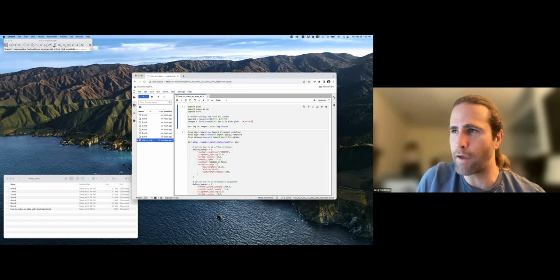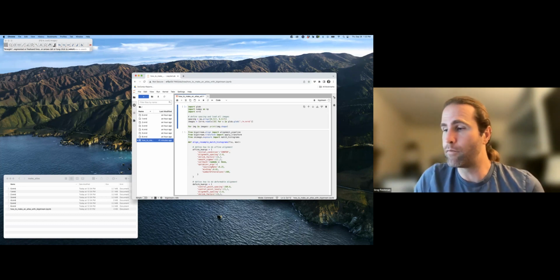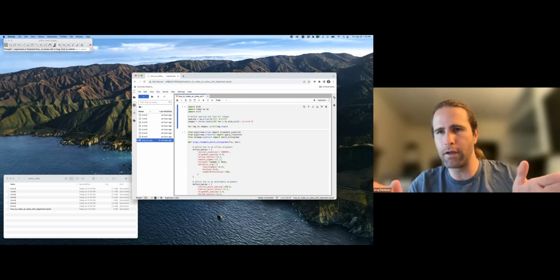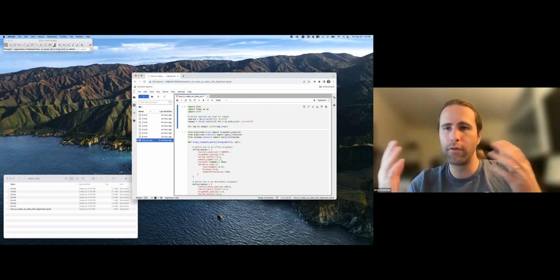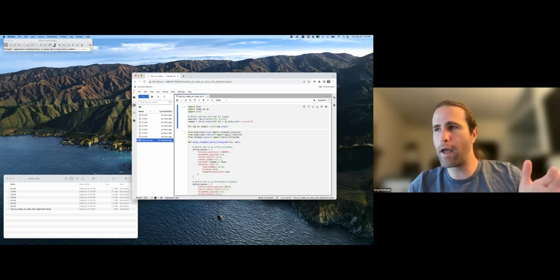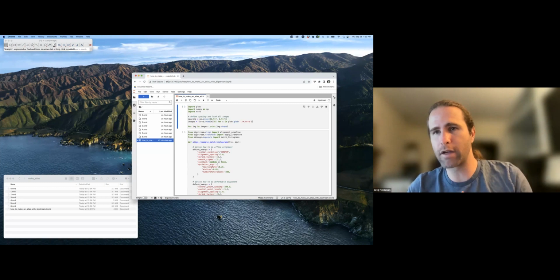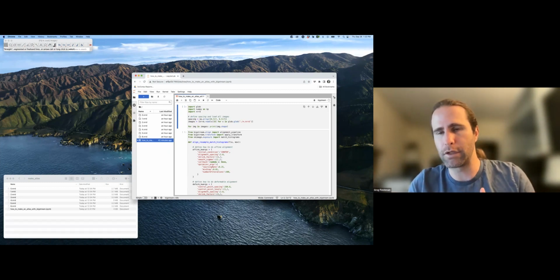But for the types of imaging that I usually do, the relevant thing to think about here is, what does the native histogram look like? It ranges maybe from 0 to 8,000, and it has a specific shape. If I sampled that native histogram into 512 bins, would that still look like, to a nice approximation, the real histogram of the image up to the bit type precision?